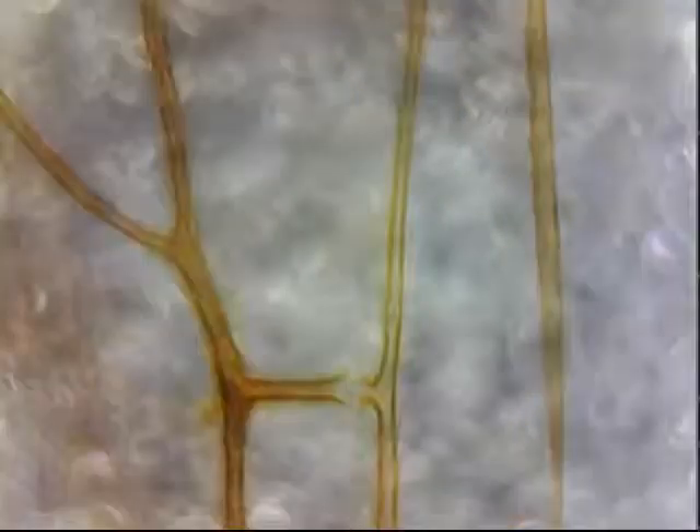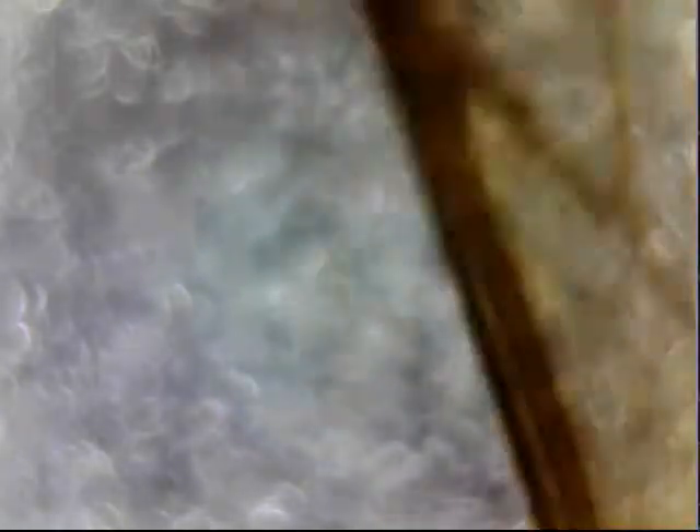And it's yellow. Because for some reason all of them are yellow. Is that just what happens when you have chitin that doesn't have any fluids there, or is it something else? I imagine they had to dehydrate this in order to get it to stay like this. But is that just chitin, or is there some kind of dye there?